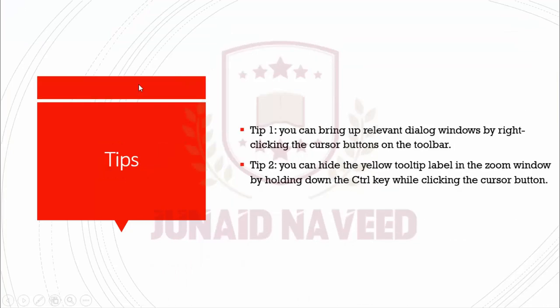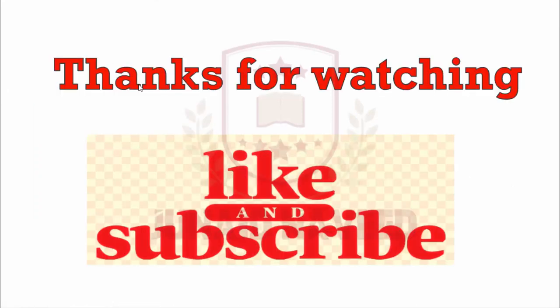I hope you understand the function of all these buttons. At the end, I would like to give you some tips. You can bring up the relevant dialogue window by right-clicking the cursor button on the toolbar. The second tip is you can hide the yellow tip label in the zoom window by holding down the Control key while clicking the cursor button.